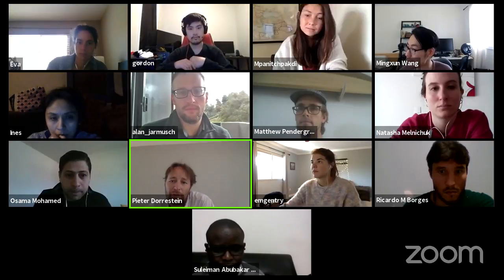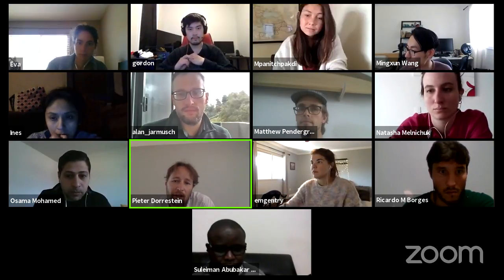Osama, I put in a link for feature-based molecular networking. Sorry, I misspelled your name accidentally. But we will have a workshop on feature-based molecular networking, but to get started, there's documentation right here.